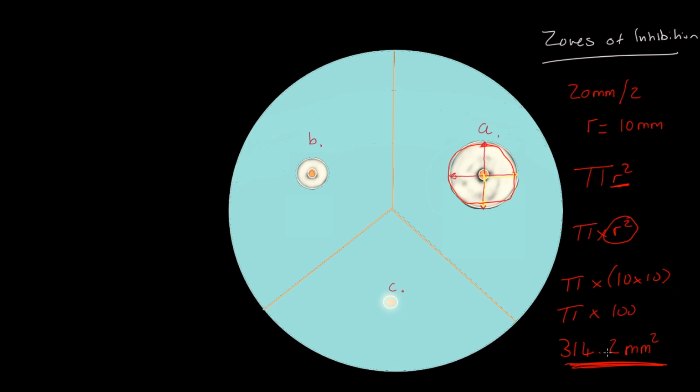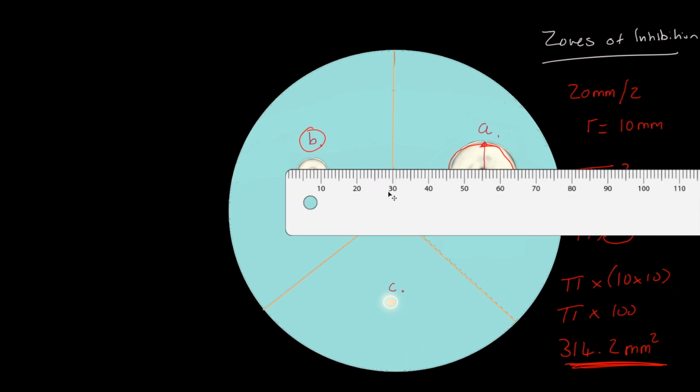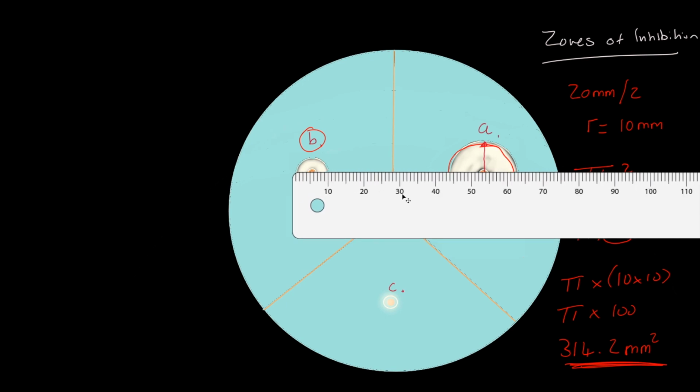And we can judge that really to be the effectiveness of that antibiotic and the conditions we've established. Now, let's look at example B. Bring our ruler back in a second. I've made the numbers very, very simple here. You guys will undoubtedly have different numbers.